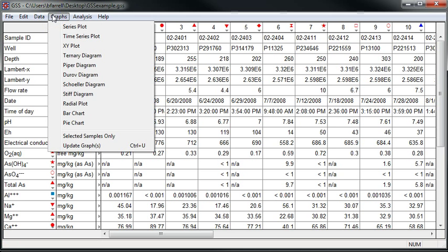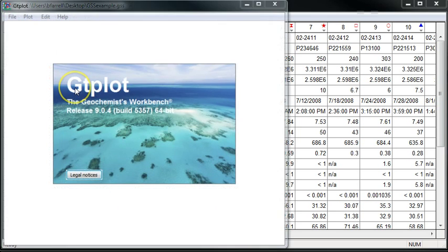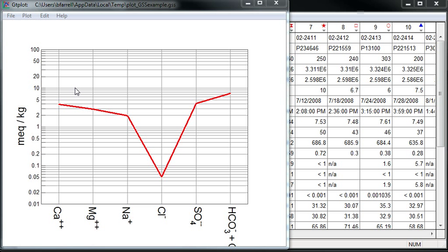I'll move to graphs at the top and select Scholler Diagram. This will launch GTplot. A Scholler diagram shows the pattern of component concentration for a single sample on the logarithmic scale.